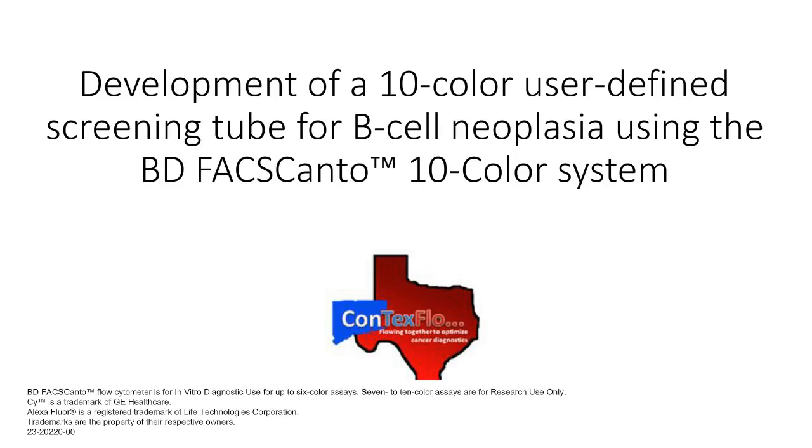Okay. Is there anything else anyone else would like to add? And also right now it's very important to add a CD22 because more and more this kind of immune modulating agent is used in the clinical setting. So adding CD22 is a great plus for this B-cell tube. Thank you, Dr. Chen.